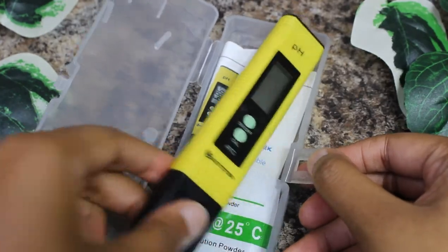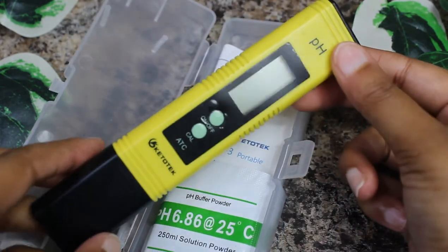pH meters are the best when you are formulating your products — they give you the most accurate pH reading. You can get one off Amazon for around $14. I'll link some down below, including more affordable options and some pricier but great pH meters to use.